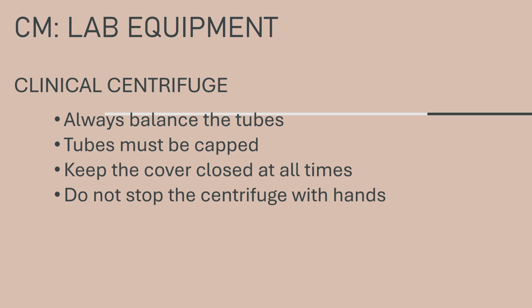Just a few reminders on the use of your clinical centrifuge. Please note to always balance the tubes. Unbalanced tubes may cause excessive vibration and uneven distribution of sediments in your sample. It may also cause breakage of your glassware.